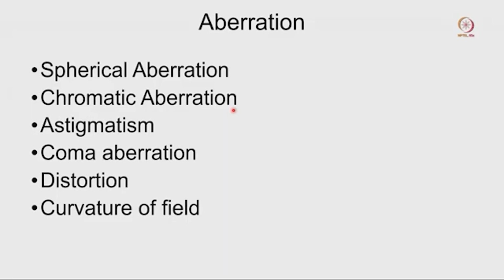In light microscopy there is a wavelength range from 450 nanometer to 750 nanometer, and due to differences in the materials of the lens system, the light rays will be separated into blue, green and red. We can see these blue, green and red lines when we image. Sometimes when you collect the image you can see a reddish or greenish appearance.